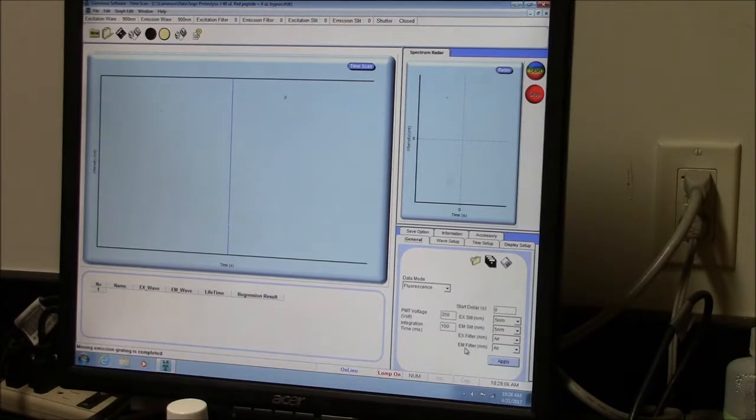So now I'll add my trypsin and start the fluorescence data collection. Actually going to start the data collection here so I can get the initial fluorescence before adding enzyme, and then I'll hope that I'm fast enough to get the trypsin in there and not make my graph too ugly.